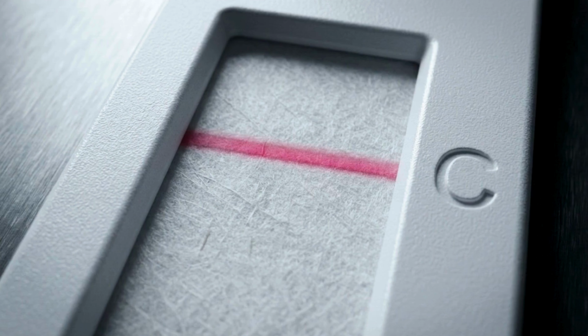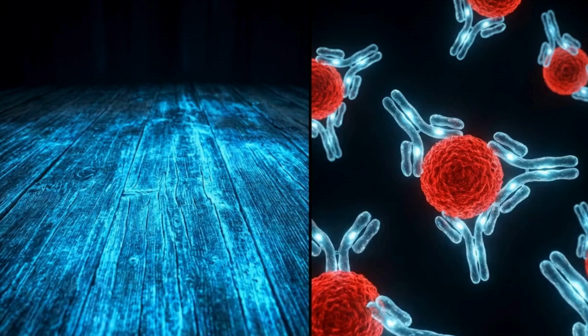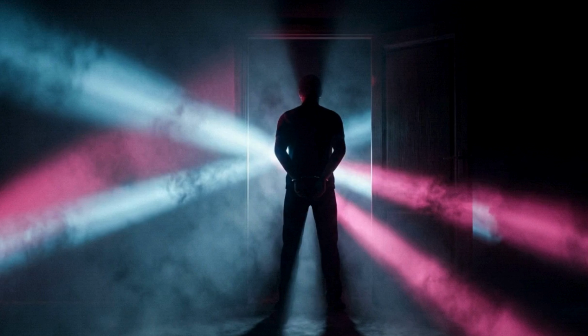Further up the membrane, a second pink control line will appear. This line proves that the capillary fluid flow worked perfectly from start to finish, validating the test against mechanical failure or tampering. From floors that suddenly glow blue in the dark to microscopic molecular traps hunting for specific enzymes, forensic serology turns basic chemistry into an investigative weapon. It forces invisible biological evidence to permanently reveal its origins, leaving perpetrators with nowhere to hide.